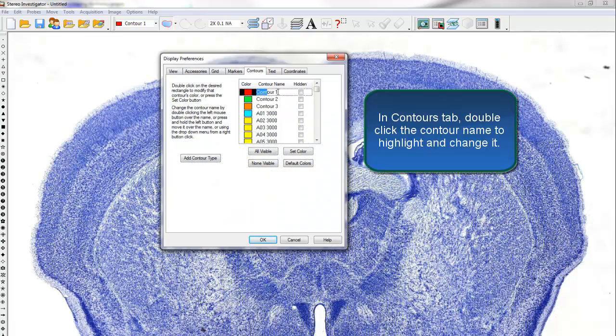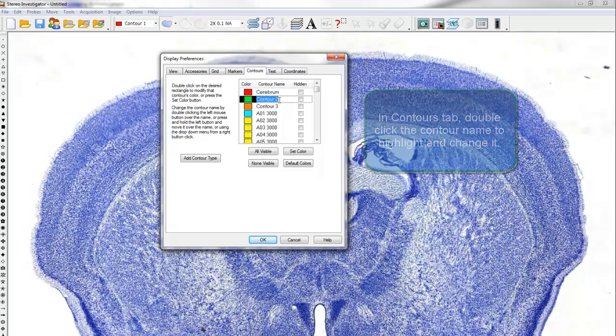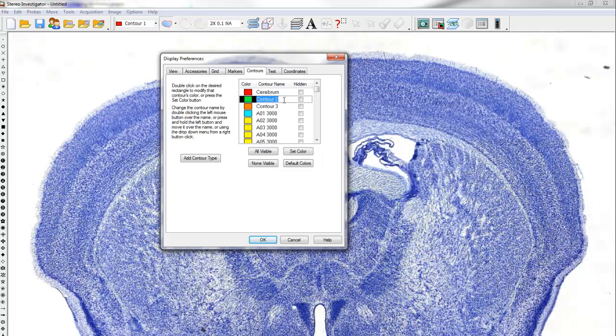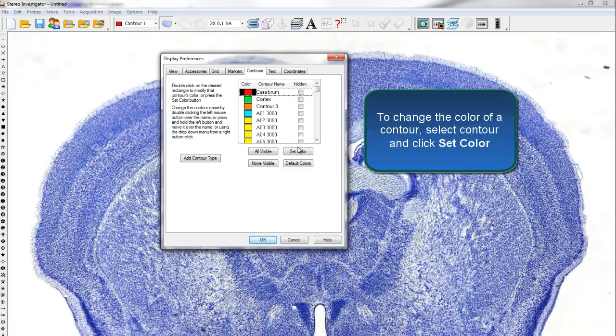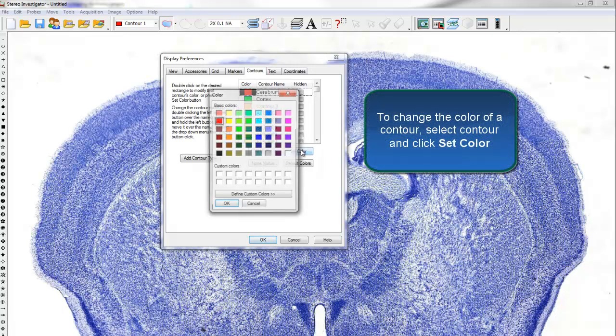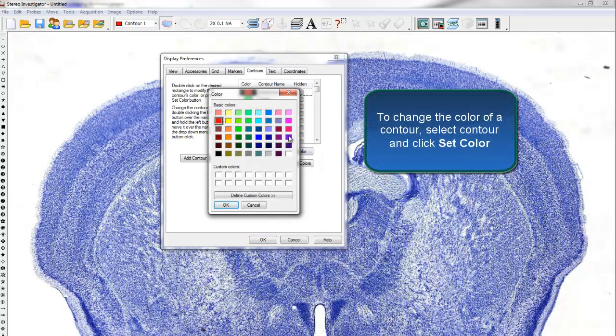Under the Contours tab, double-click on a contour name to highlight it and change it. To change the color of a contour, select the contour and click Set Color.